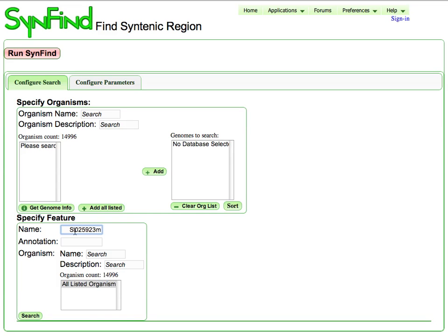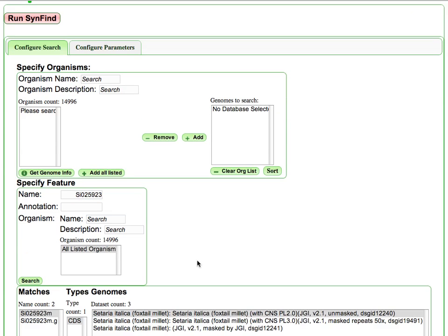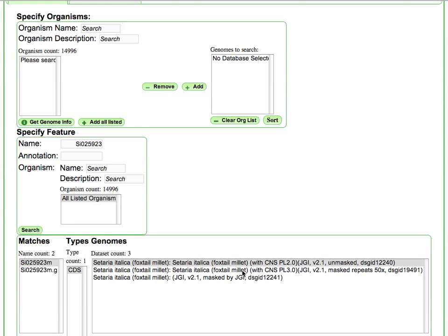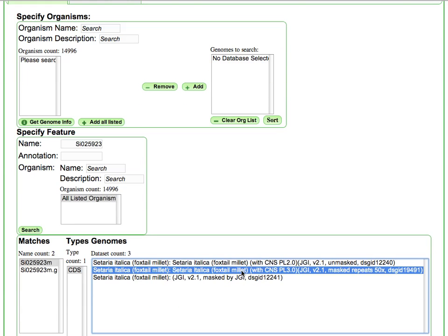In this case, I'm going to use a gene from Setaria. And I'm going to go ahead and select the version of that gene from the masked version of the genome.